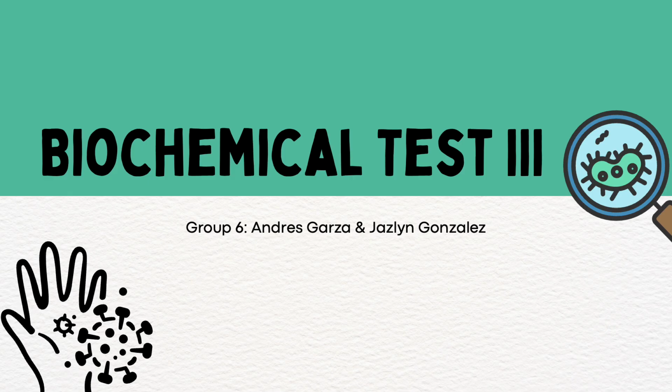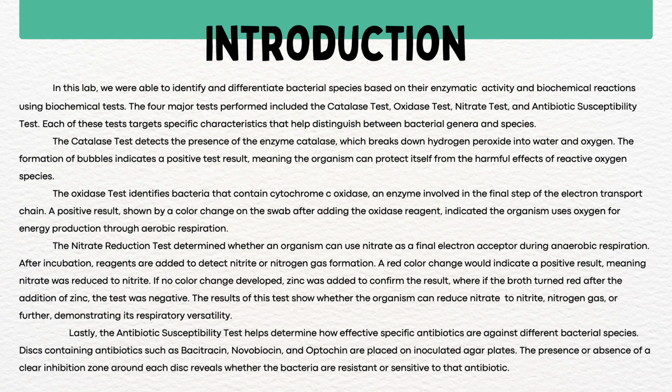Today we will be going over Biochemical Test Lab 3. In this lab, we were able to identify and differentiate bacterial species based on their enzymatic activity and biochemical reactions using biochemical tests. The four major tests performed included the catalase test, oxidase test, nitrate reduction test, and antibiotic susceptibility test, each targeting specific characteristics that help distinguish between bacterial genera and species.